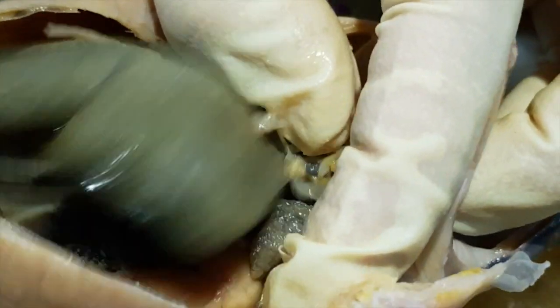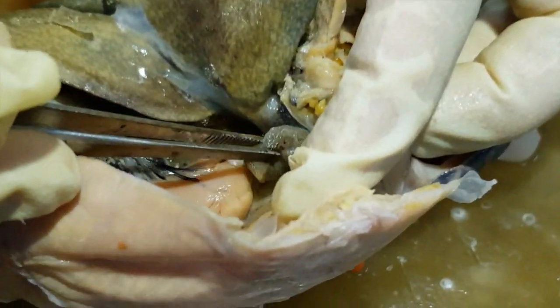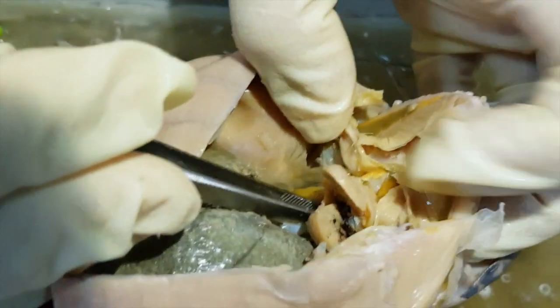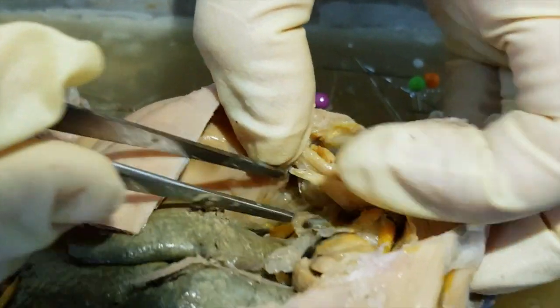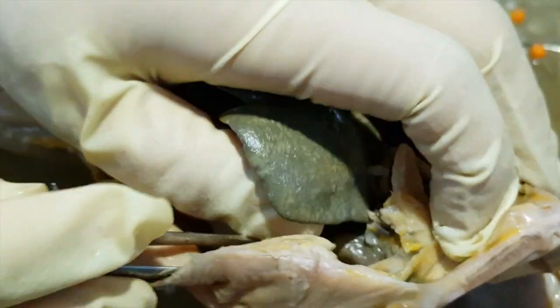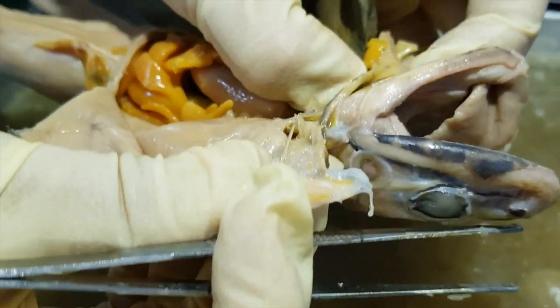On the side here is the lungs. There's another one here on the other side. That one is the lungs. Then just deflect the organ on the side so you can see some parts.